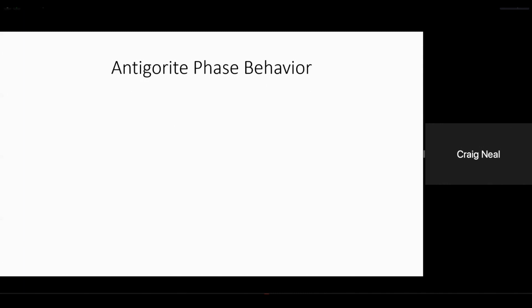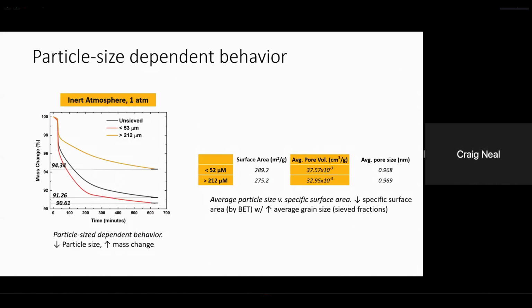So we want to take this material and we want to look at its temperature sensitivity. And in keeping with describing the material in outer space relevant conditions, we are going to test the material in an inert atmosphere, in air, and then under vacuum.